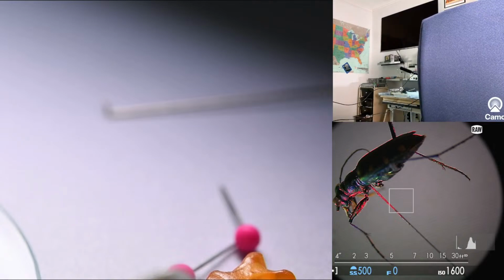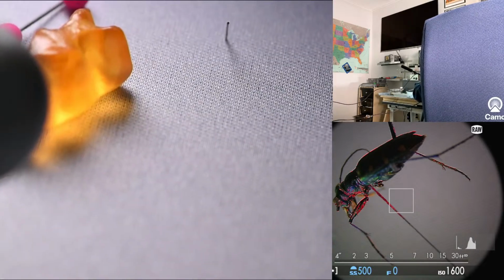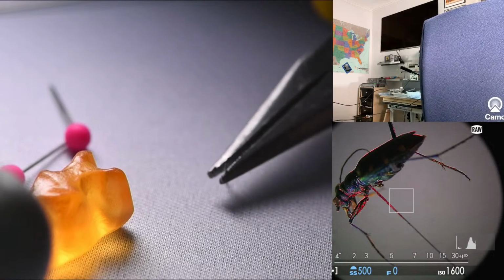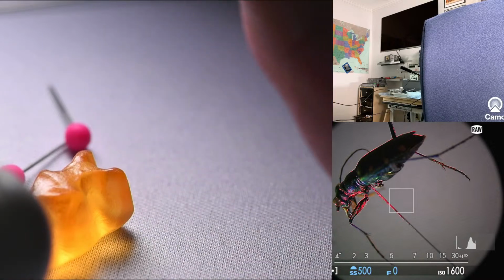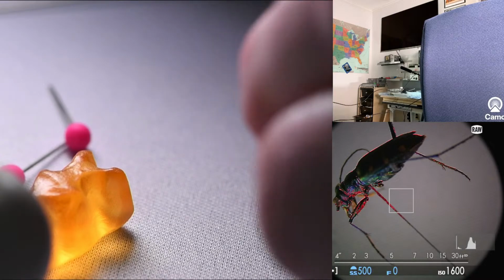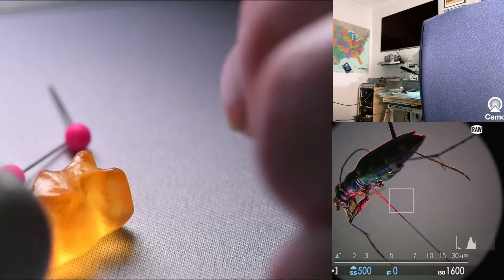Alright, so what I'm going to do with my needle, let me see if I can show it to you. It is right here. There. That's better. So what I'm going to do is pick it up at the blunt end. That is the blunt end that I am holding right there, and then with my finger flat on the needle, I'm going to rotate the pliers against my finger like that, and what you end up with is a small L like so. This is a perfect glue applicator for putting appendages back on, as you'll see.